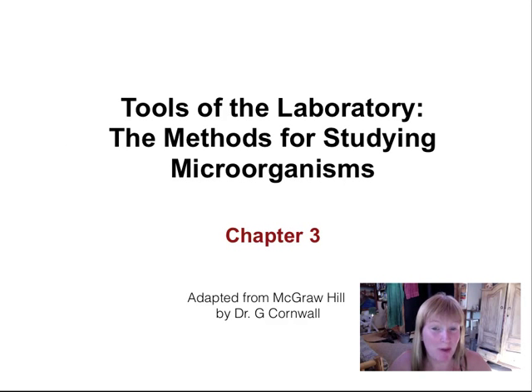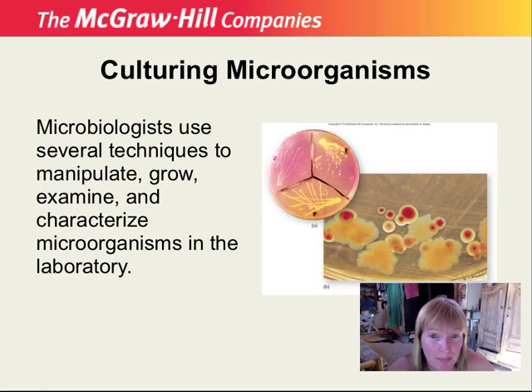In this chapter, we'll be taking a look at some of the tools of the laboratory, so the methods that we're going to use to study microorganisms. This chapter is super important because you're going to be doing your lab work at home. So this chapter will give you an introduction to how some of those techniques work.